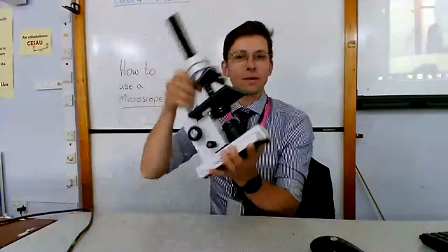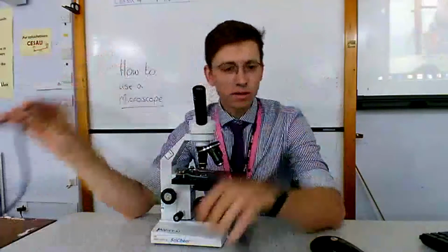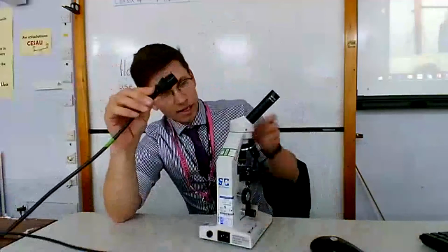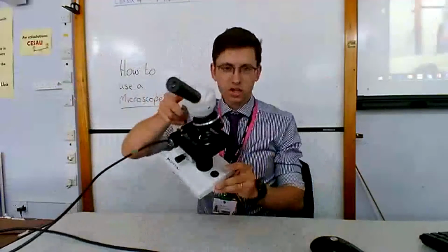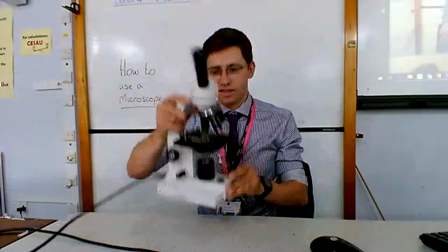Obviously, mine's already plugged in. It won't be plugged in when you're walking with it. Okay. Also on the trolley, you will have a cable that plugs in to one of the electric points around the classroom, and this one just plugs into the back there. Sometimes you might have a little switch on the back. My switch is on the front, and we can see that the light turns on and off like that.